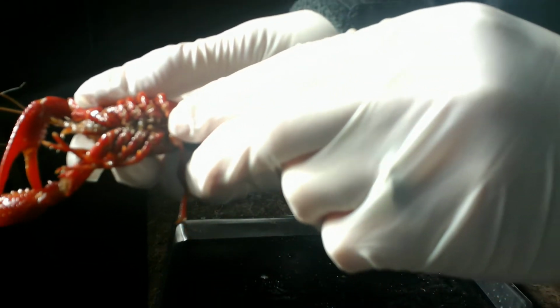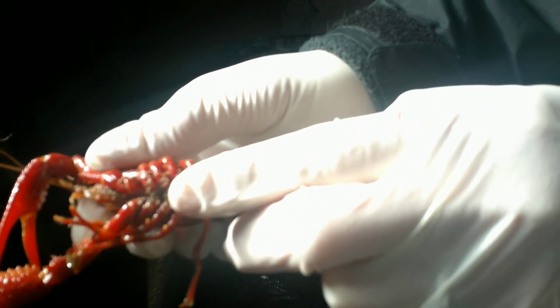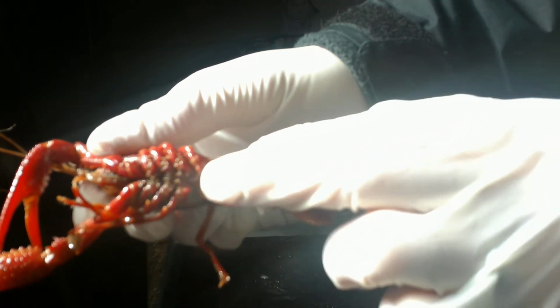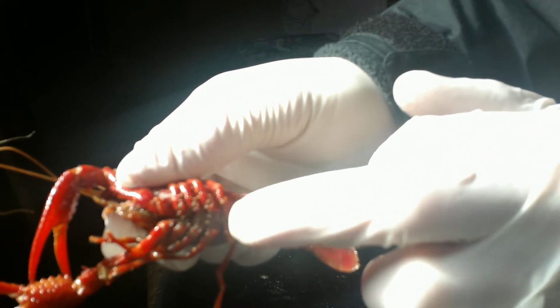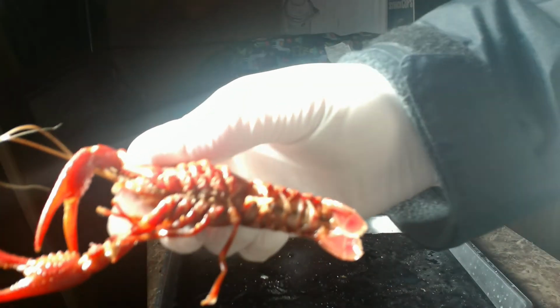And here we have two kind of like extra claspers, as well as some extra claspers underneath here. I know the lighting's not the best in here. I'm trying to get the best I can. So because of these extra claspers, we have a male. If it was a female, there would just be a seminal receptacle here. But since we have extra claspers for grasping and everything, we know that we have a male.